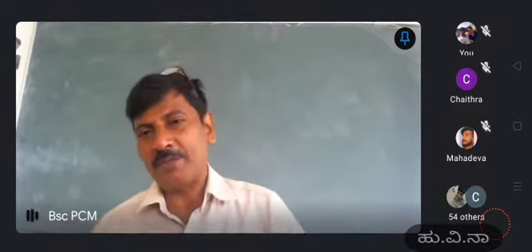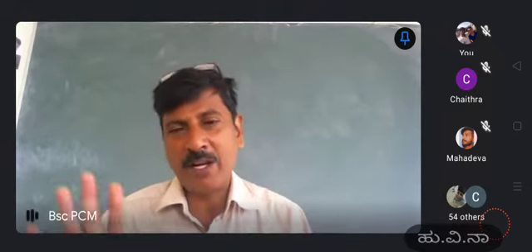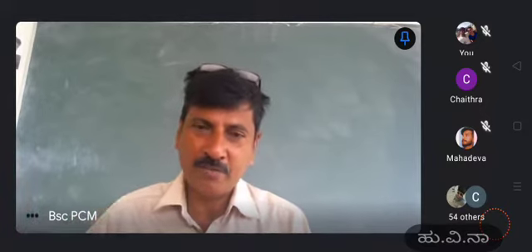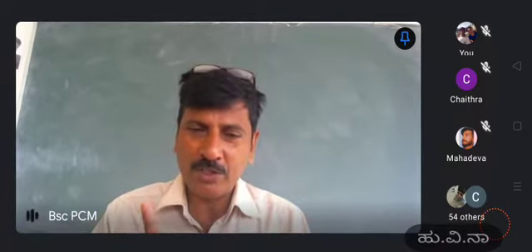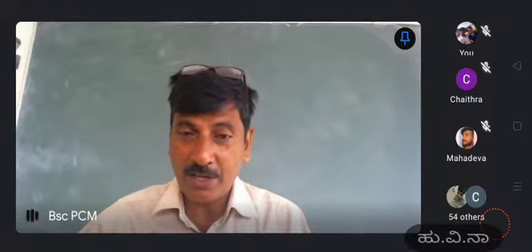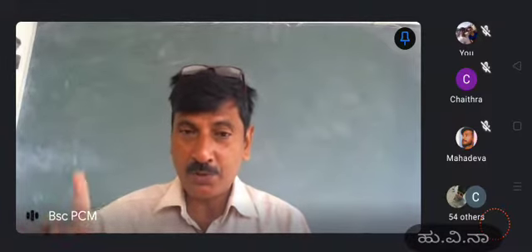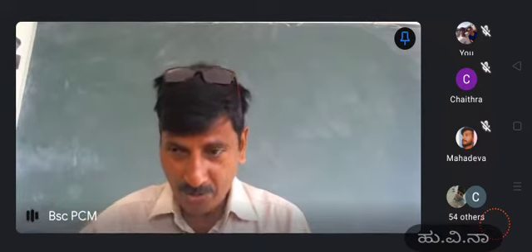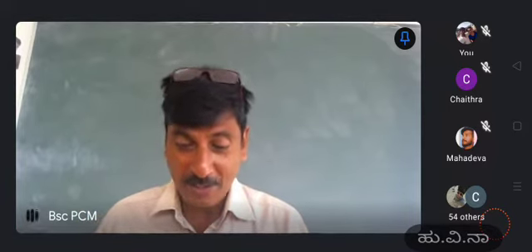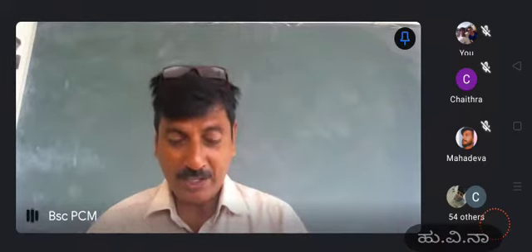That much sample is enough to carry out NMR analysis. So I am going to give you another important point: the advantages. It is very useful to study natural products as well as some photochemical reactions. Not only that, even nowadays NMR has improved like anything.